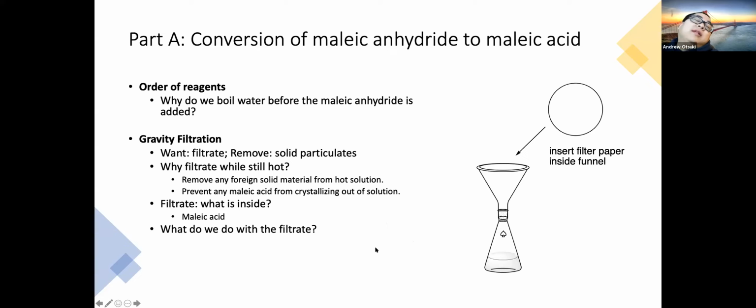So if people don't read the lab, they might think, oh, we're done, let's just leave. But no, that's not it. We're going to keep the filtrate and move on to the second part of the experiment. So we're going to let it cool to room temperature for maleic acid to crash out of solution. And nope, we are not done.